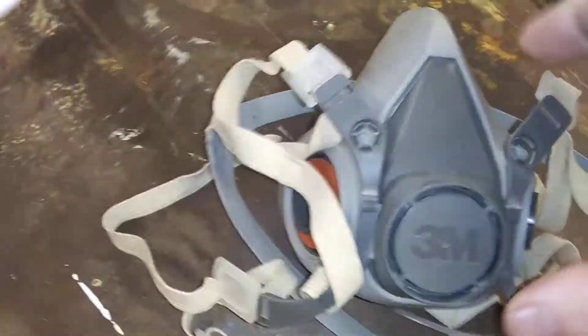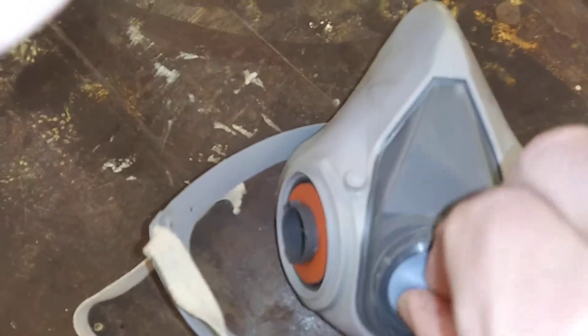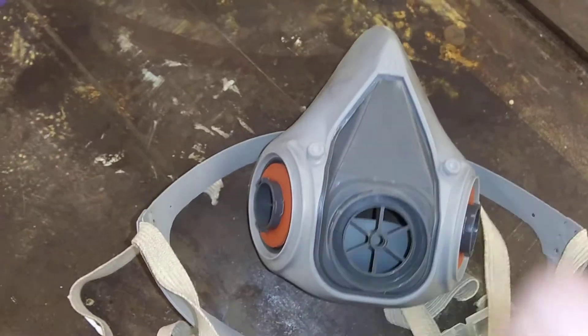You can see it clips right there — put your hand at the top and pop that off. That pops right out. It's got a little nipple on it. Make sure you put that back in place whenever you put it back on there.